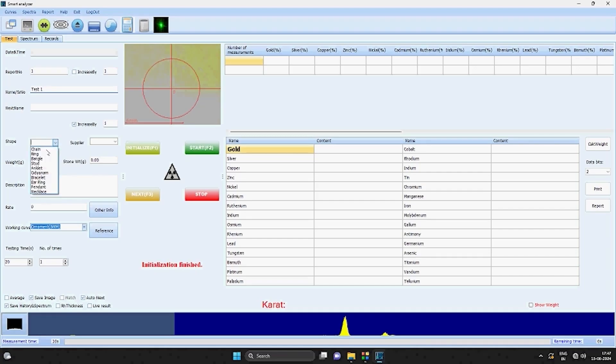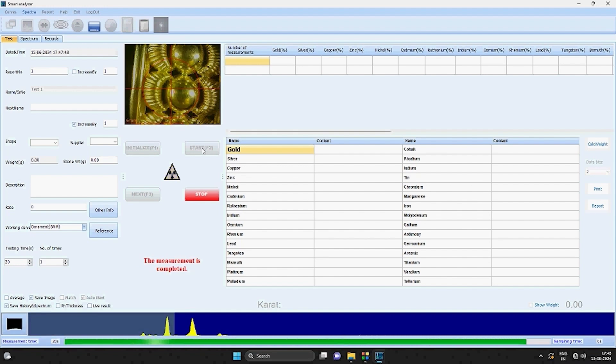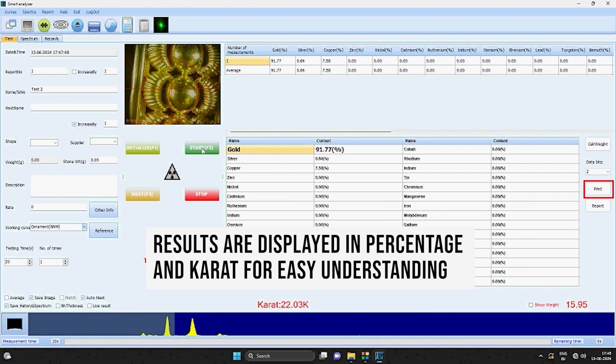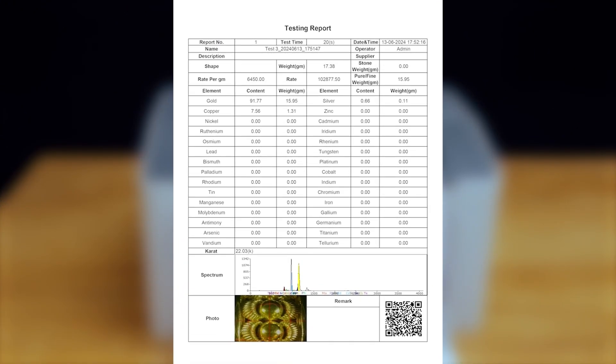When testing jewelry, users can input various fields such as customer name and ornament description, making Redlands software unique in the industry. Within fractions of seconds, the software shows results in real time, concluding testing within 20 seconds. Results are displayed in percentage and carat for easy understanding, providing clear valuation for tested ornaments.